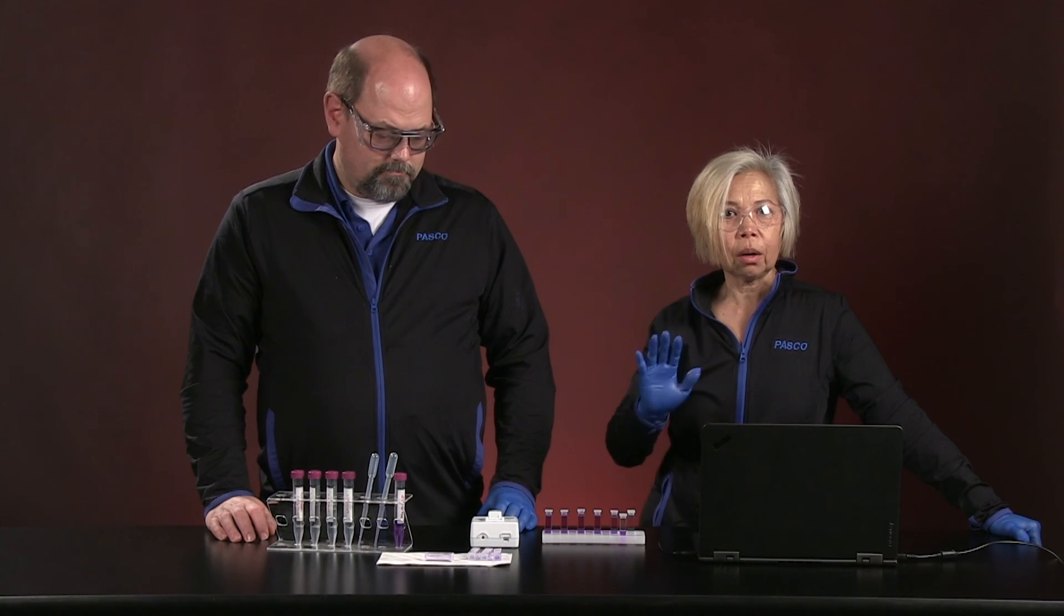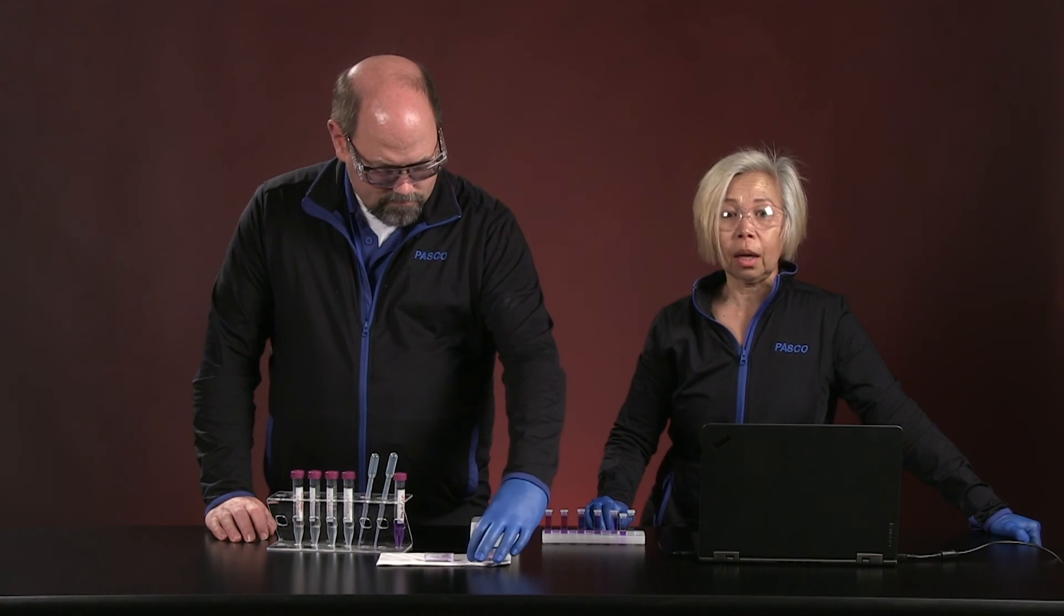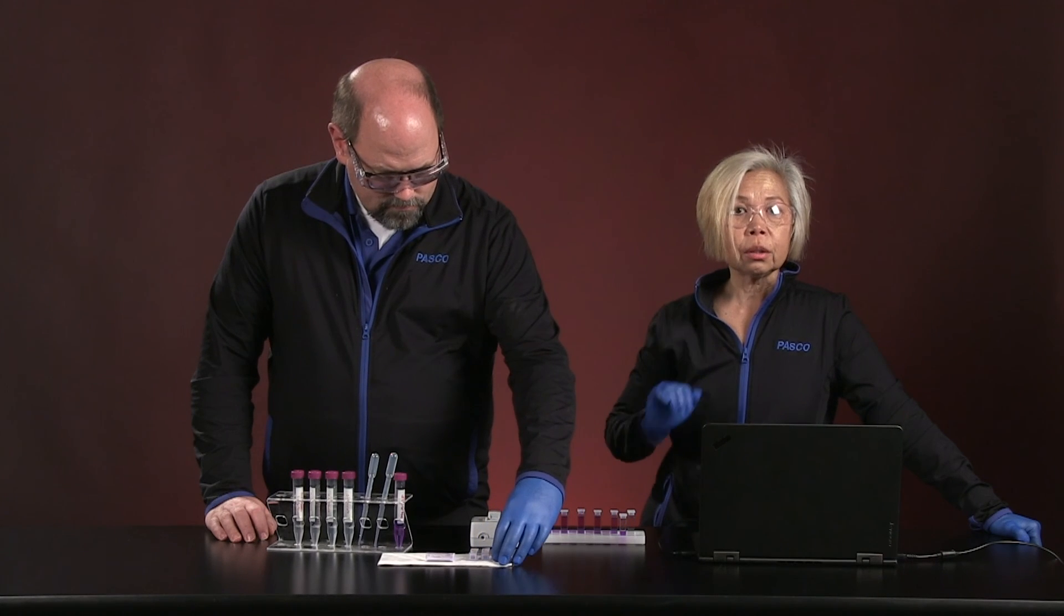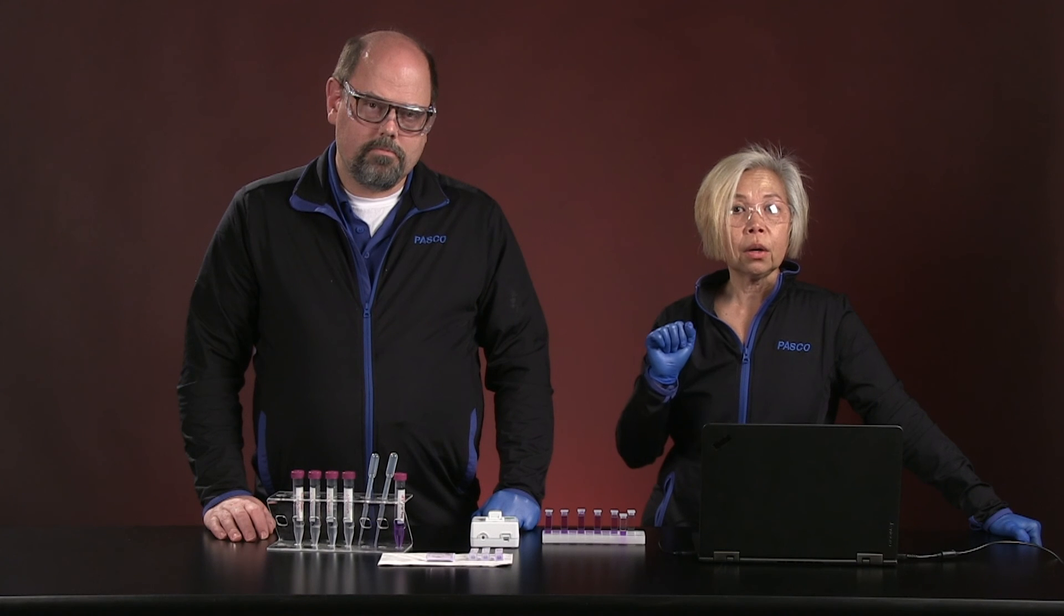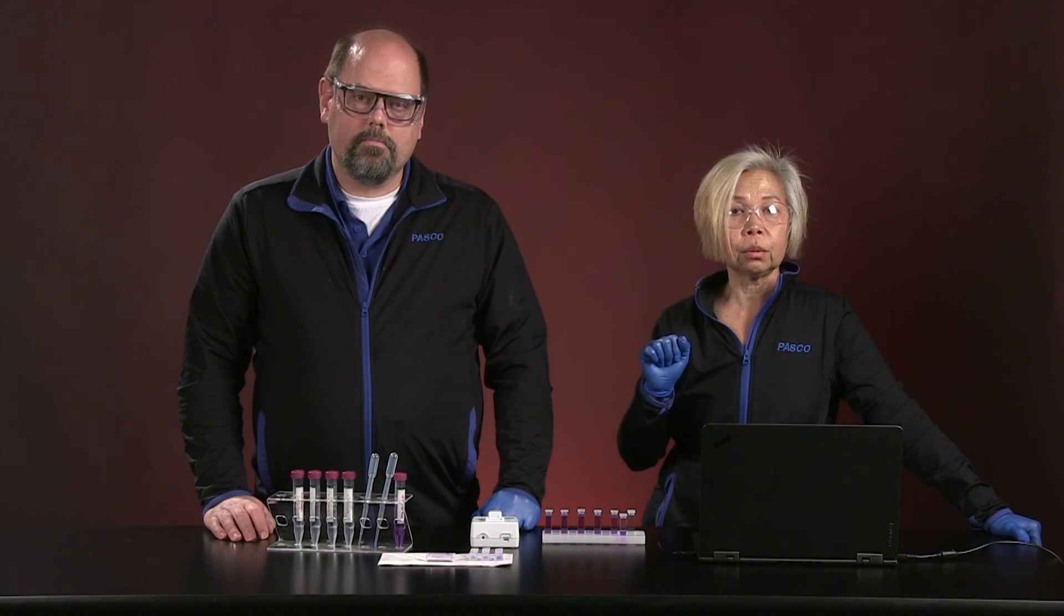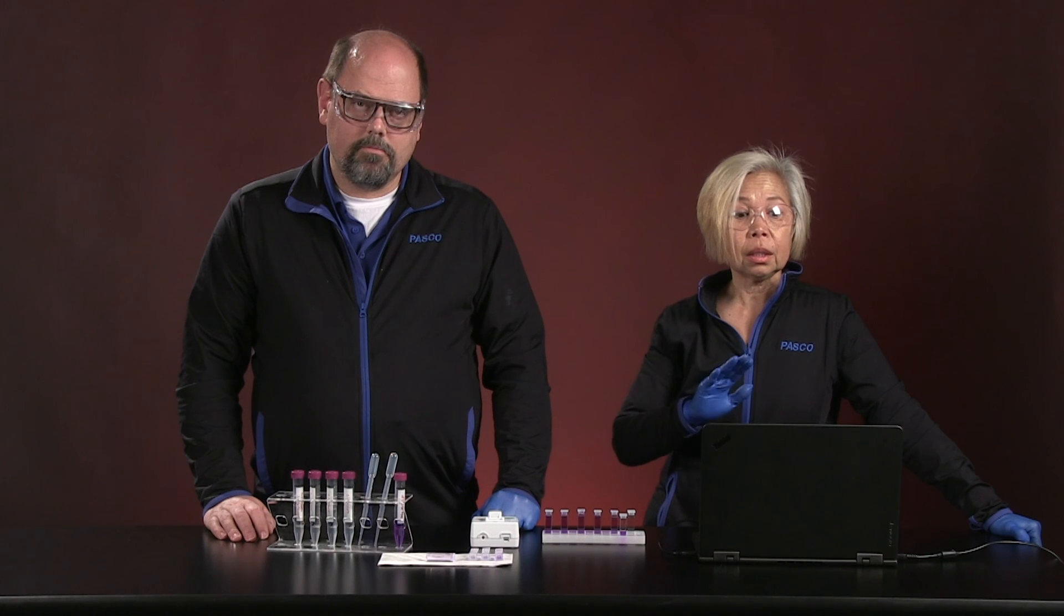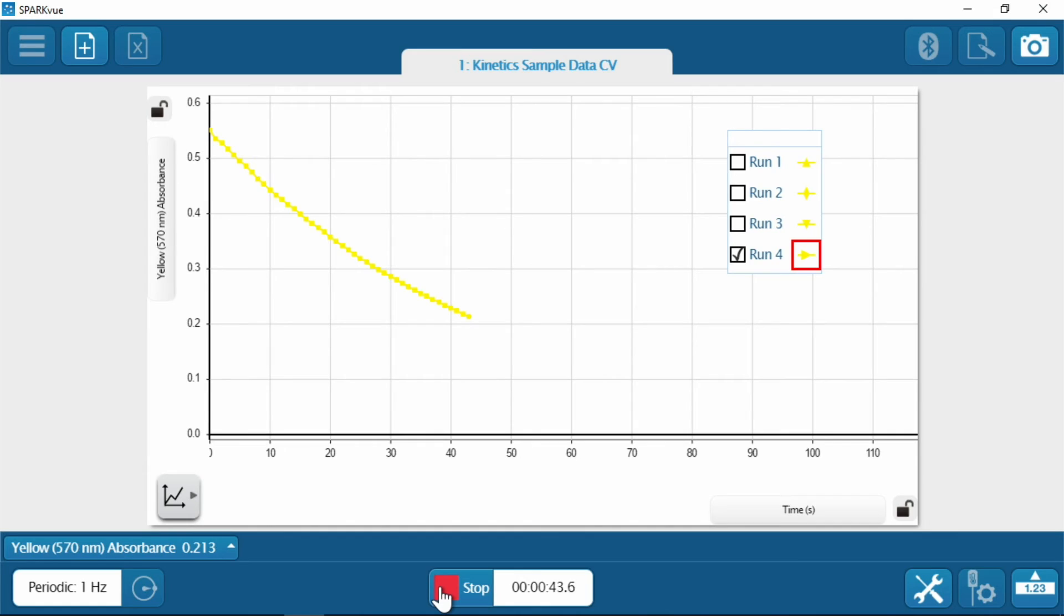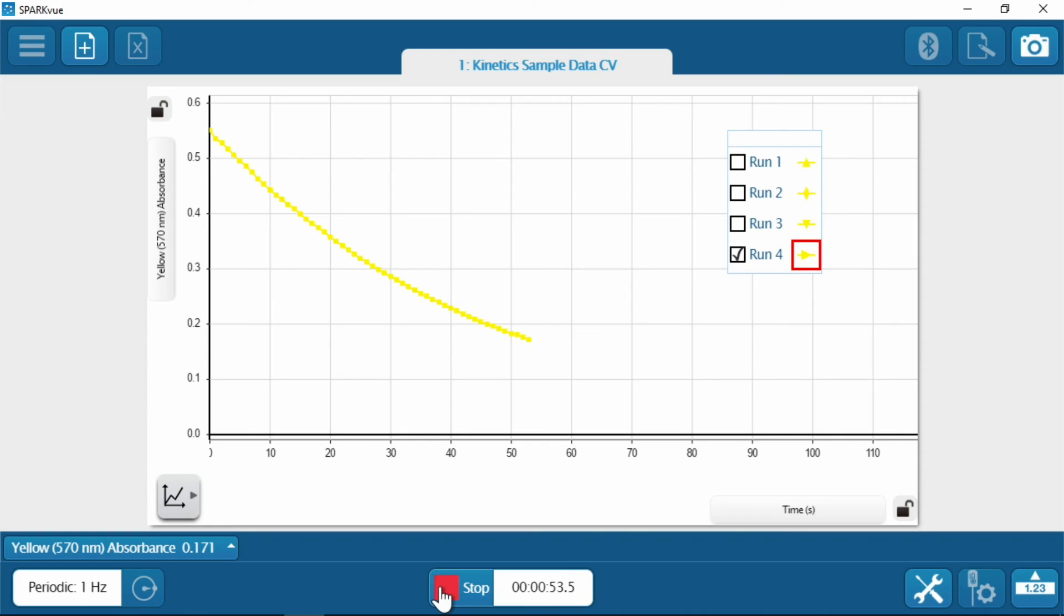So while this is running, I want to throw out some questions. You are AP or advanced students, and this is a very good time to start thinking about how you want to analyze this data. First of all, as you look at the curves coming about, do you notice if they are absolutely linear or are they non-linear? If they are non-linear, it is really important for you to select a portion of the curve that shows you the greatest change in rate. This is going to be the initial rate in your situation. So whenever you study rate data, you got to make sure that you are picking the portion of the curve where you're getting the maximal change in Y for the X that you're going through.